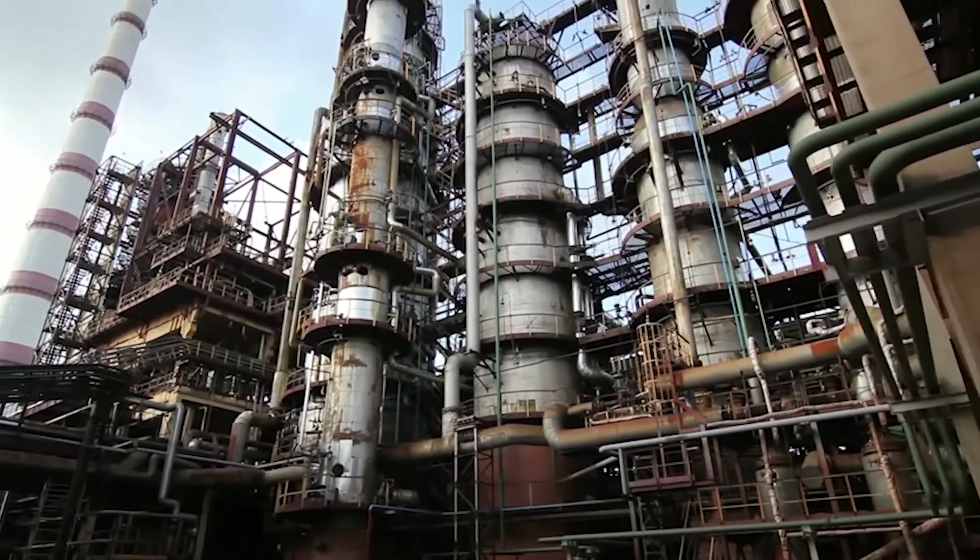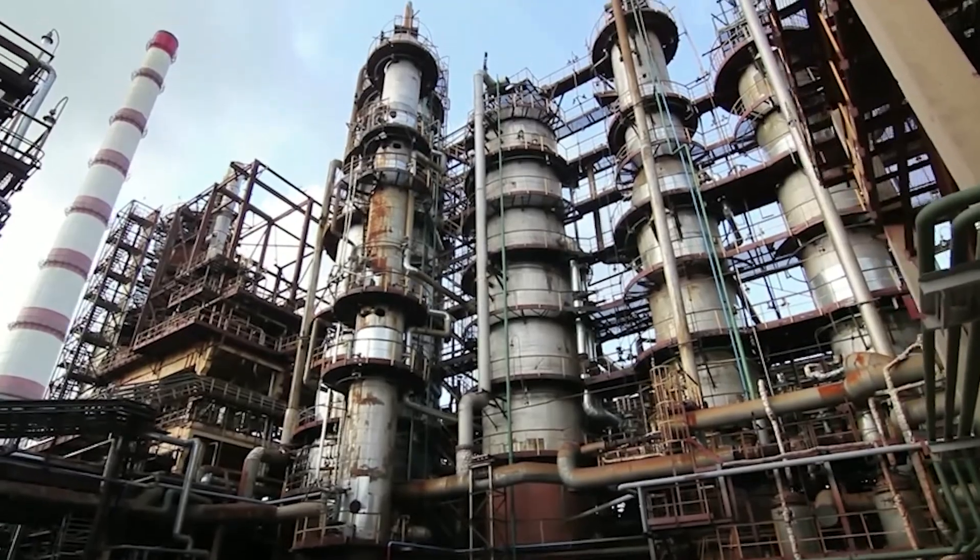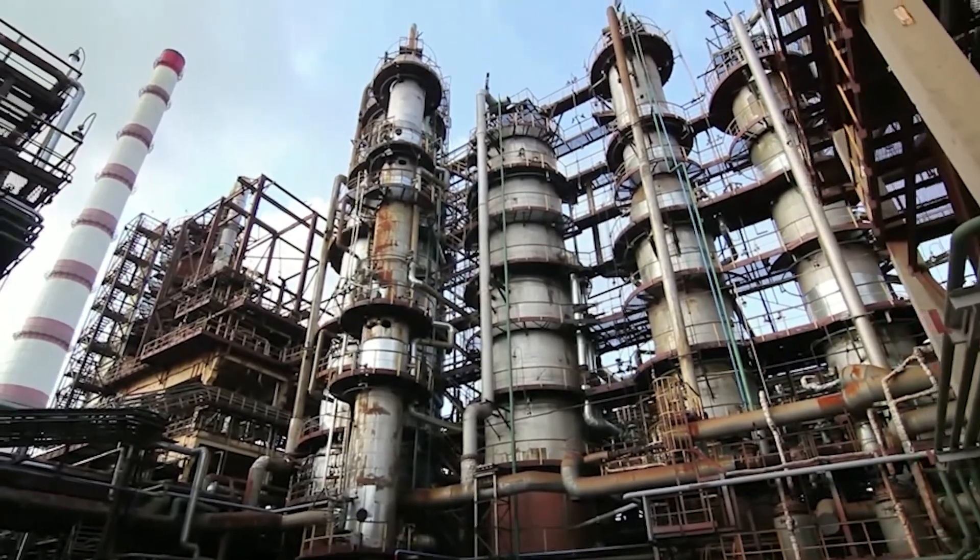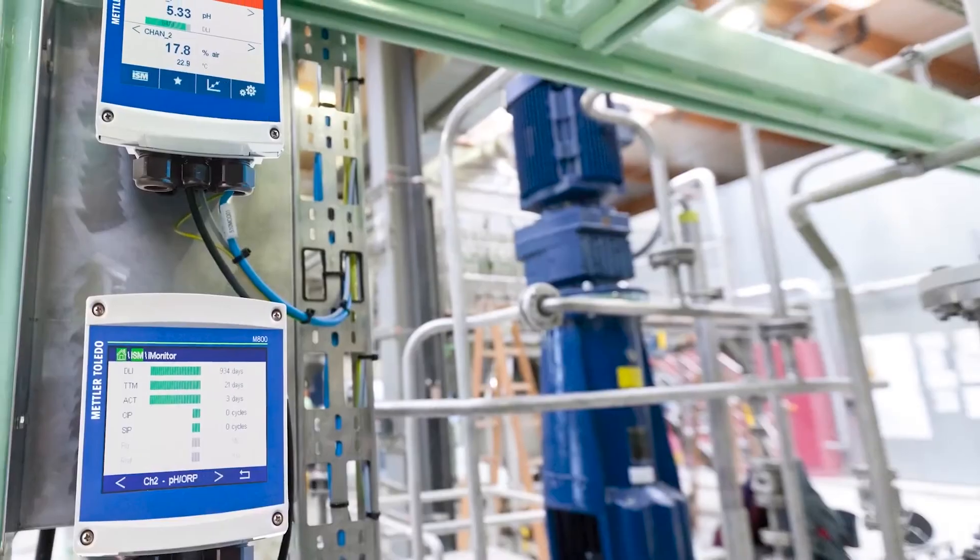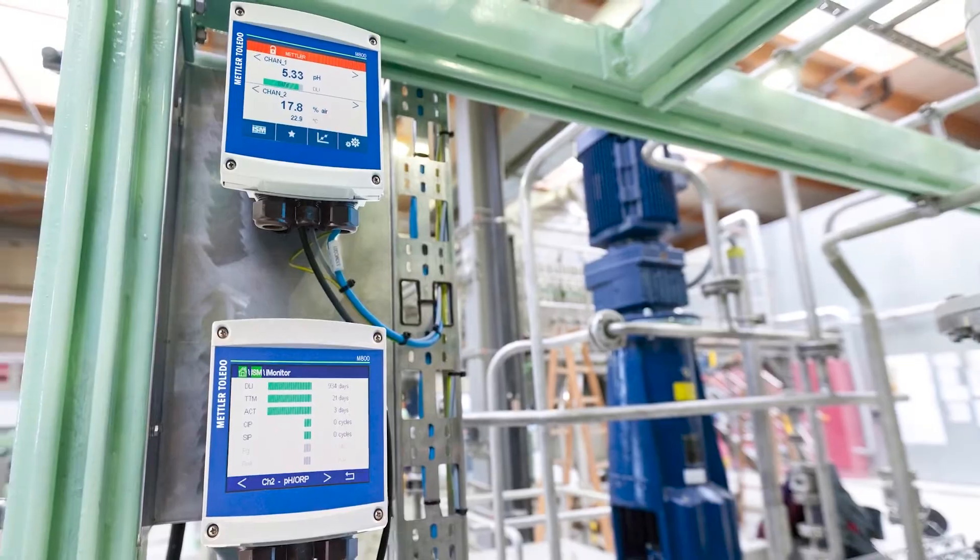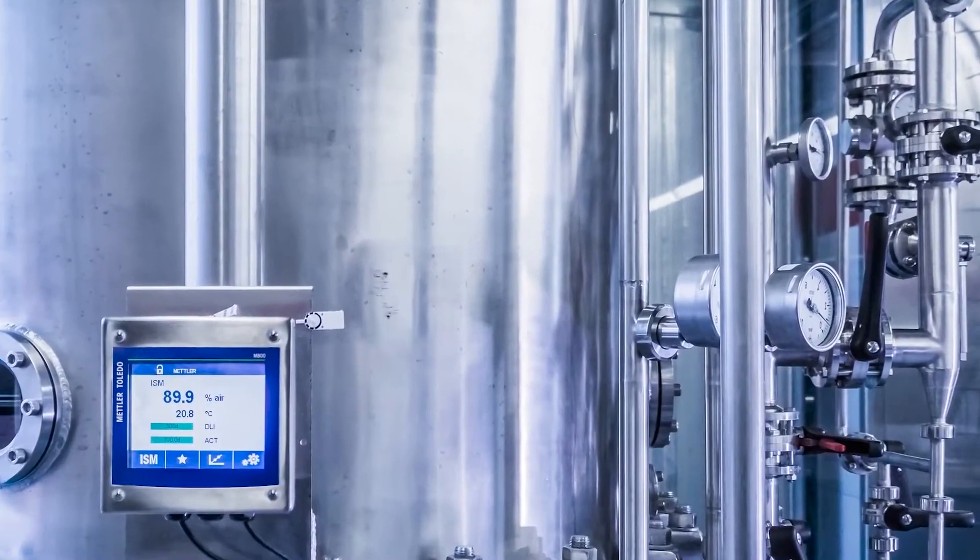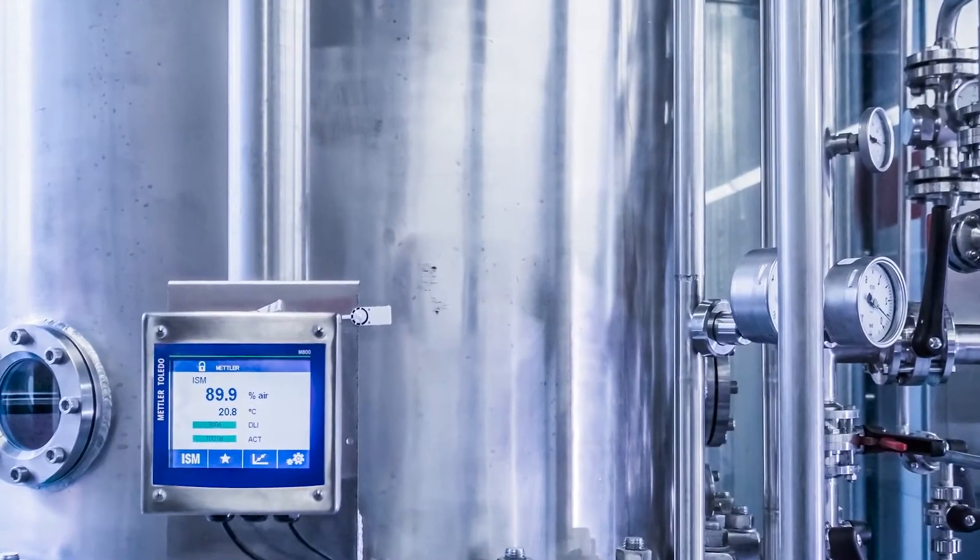Each transmitter has to be set up specifically to meet the production demands where it measures. It is a time-consuming task to manage all these settings separately for each measurement point and transmitter.